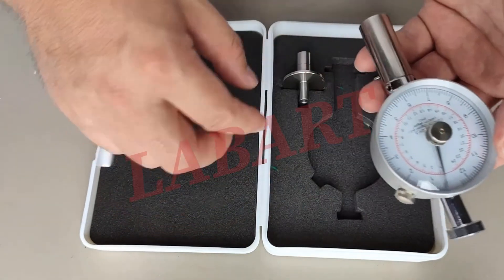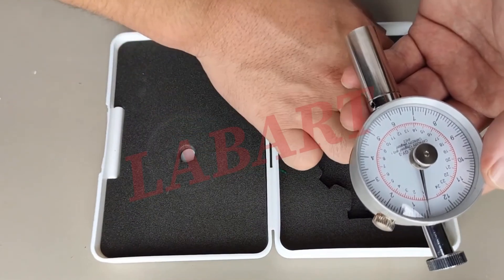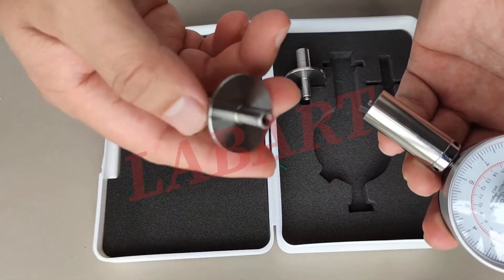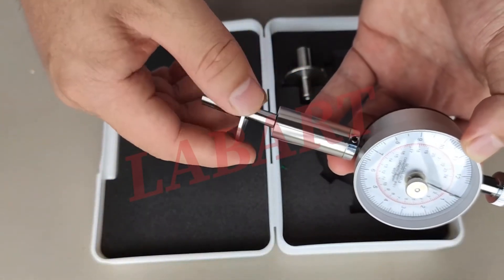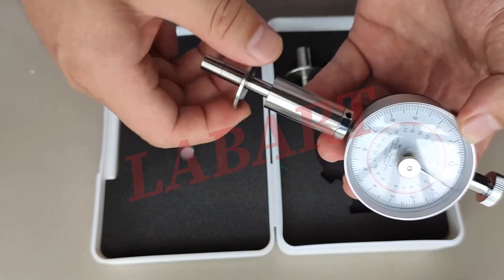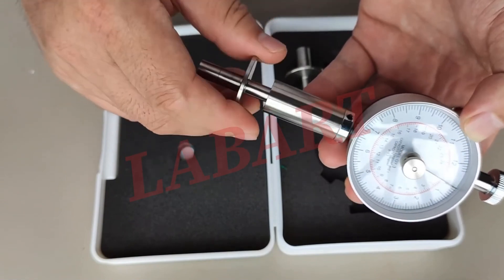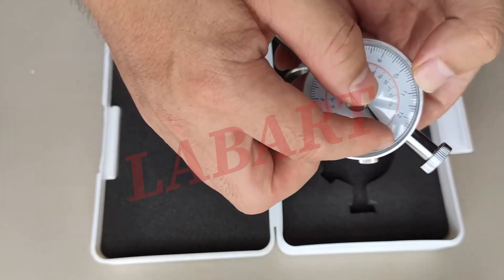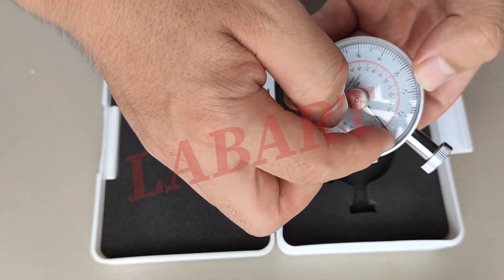Okay. Now I'll just roughly show you the operation of this one. This is the testing tip. We connect it to the penetrometer and screw it on. Like this. Now both of the needles are already in the right position.